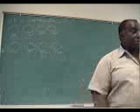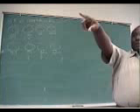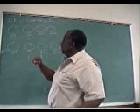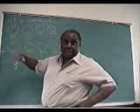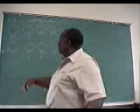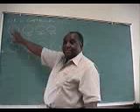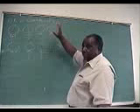So what you're going to do, I have a UV lamp back in the back, and notice I have the light off. After you put the 10,000 cells on the plate, the control will not get irradiated, or you can irradiate with the lid on because it protects the cell. The UV can't get through. But if I remove the lid, irradiate 10 seconds, then I put the lid back. And the same thing for 20, same thing for 40.